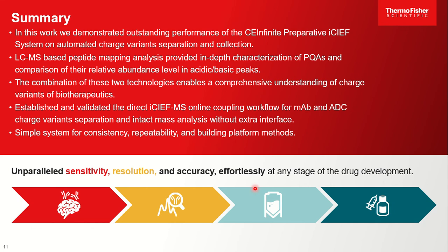The LC mass-based peptide mapping analysis provided in-depth characterization of PQAs and comparison of their relative abundance level in acidic and basic peaks, and the online coupling workflow successfully separated and achieved real-time intact protein analysis of pembrolizumab and TDM1 charge variants. And also, this is a simple system for reproducibility, method development and transfer.